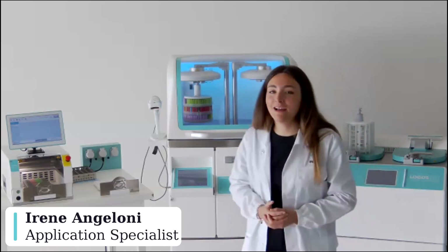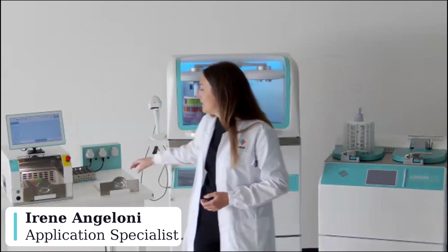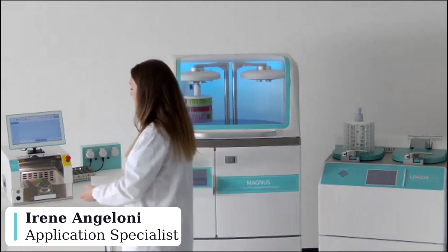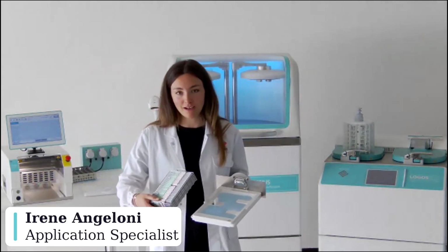Okay, no, T-tracker works with every kind of basket, so with the squared one, but also with the Magnus. I have here these accessories. That is the tool that you need to insert the rack in the unit, and this is, for example, the one for Magnus and for Logos Evo, but you have also the one for the squared rack.